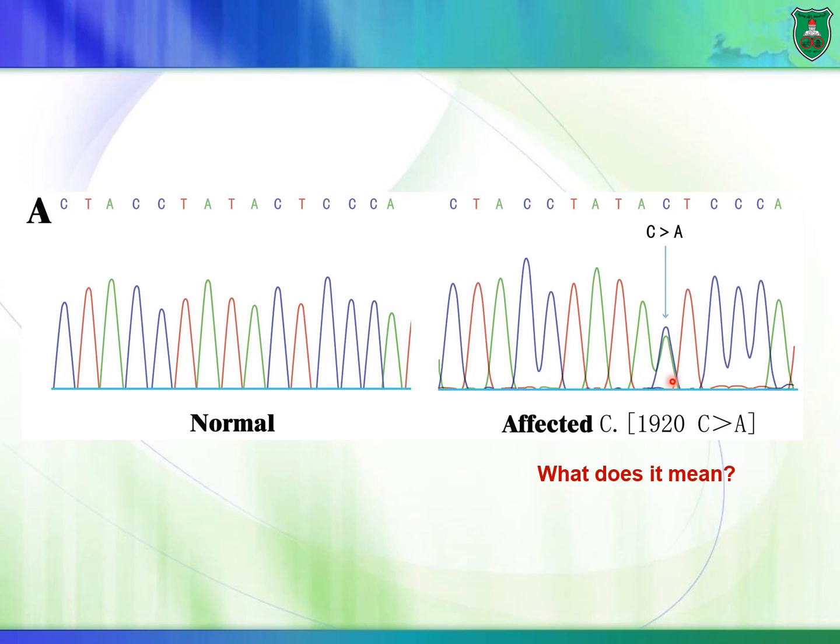There is a variation. Remember that these signals come from both mother's DNA and father's DNA. If it gets to a certain position, let's say that the mother's DNA is C and the father's DNA is G, the DNA polymerase would read both, and it would add to a portion of DNA fragments that are synthesized.